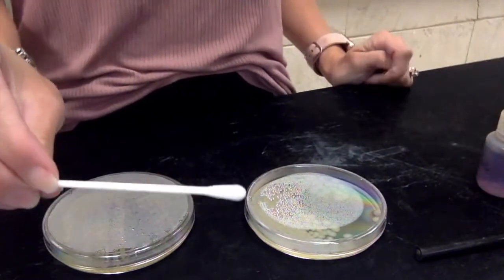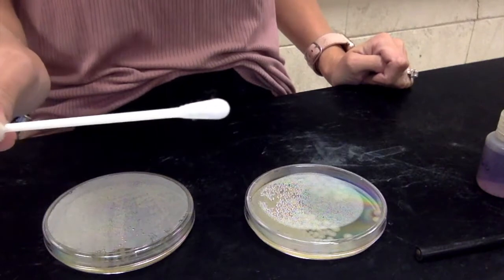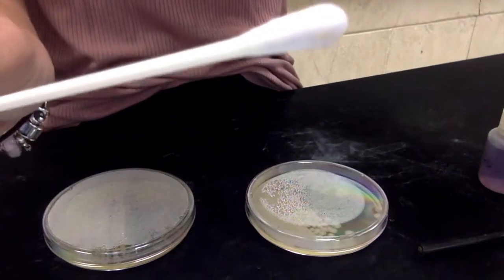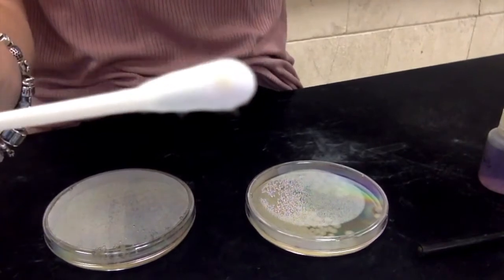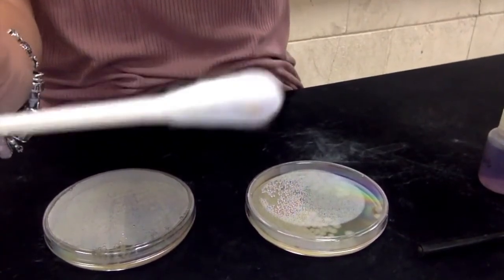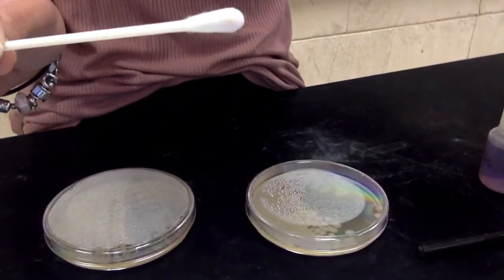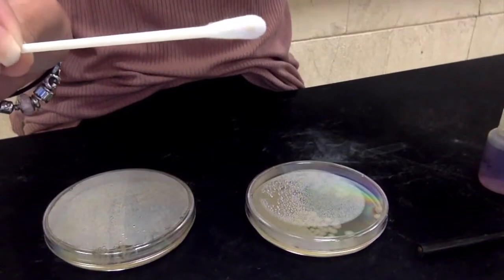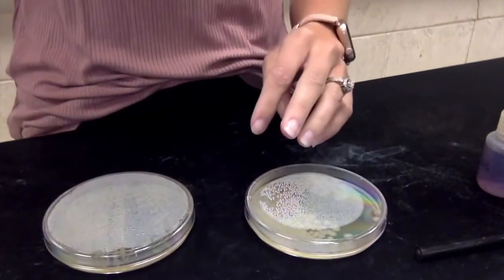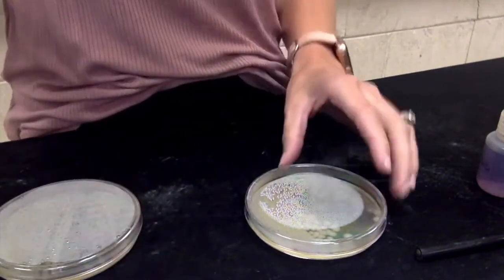If this is positive for oxidase, the colony itself will turn purple. It's a dark, deep purple. I don't know if you can see that, but you see that colony is still yellow on there. No purple color. See? Colony is still yellow, no purple color. So that is negative for oxidase. So E. coli is negative for oxidase. So it does not produce oxidase.